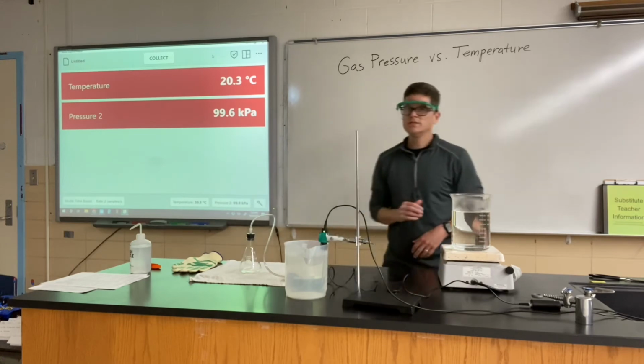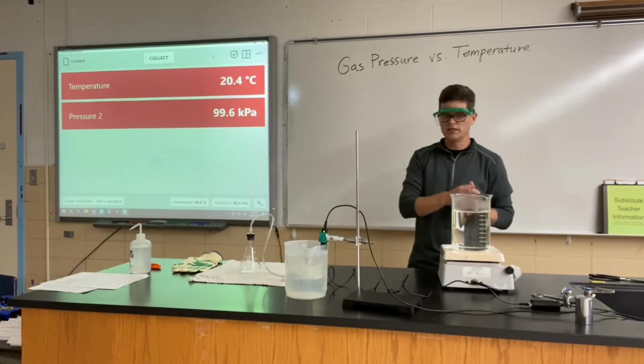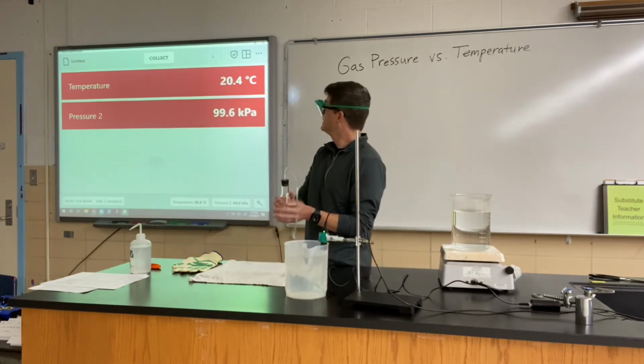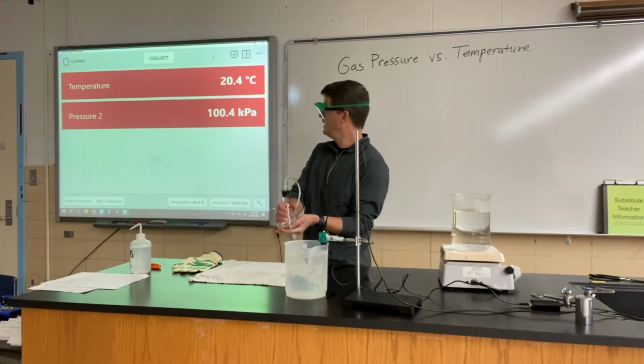And then the next one is the hot water bath. I want to be careful with this one. I don't really want to have super cold glassware going into super hot glassware. So I do want to warm it up a little bit with my hands until it at least feels back to kind of room temperature, maybe a little higher. You can see my hands are enough to warm it up already. The gas pressure is up over 100 kilopascals.